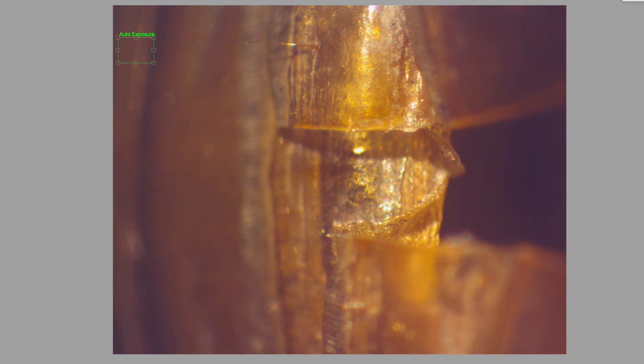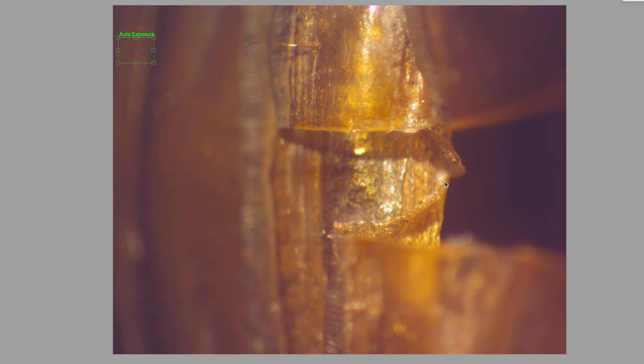I can't really see as close as I can get. This would have been part of the line where it broke across. There's probably specific, I imagine that it's narrower here so that it will break along that spine. Because you want to break at the weakest point, and so over evolution or whatever you believe in, that point would have been thinner. So maybe there's a crease right there that then it breaks along.